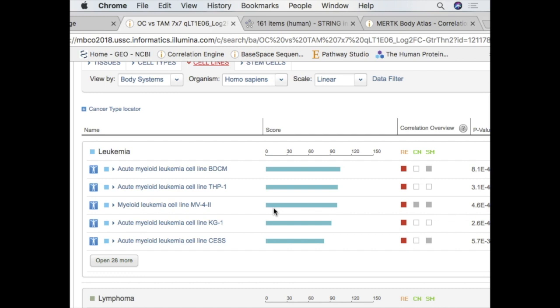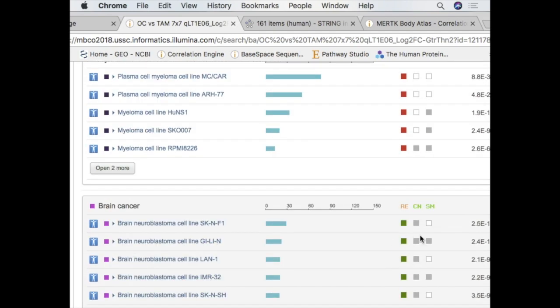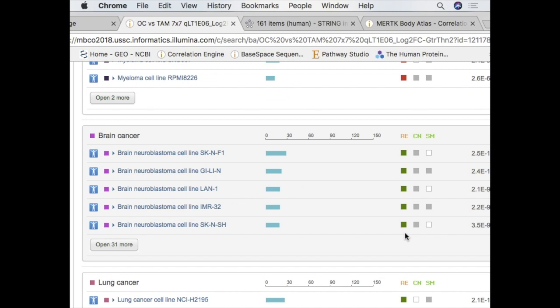It would basically tell you these genes are probably coming from your immune system. This is probably stromal. What you'll get is basically it'll be red or green, and you'll see things that are the actual opposite would be green. So based on this readout, you could kind of put together what your potential cell types are in the tissue that you're looking at. Got it. Yes. Okay.